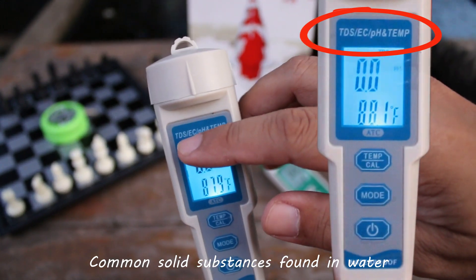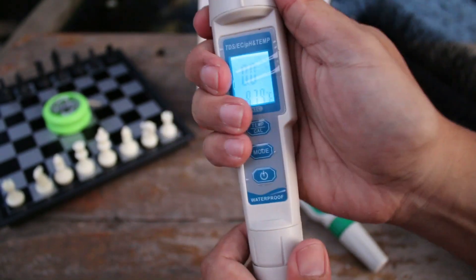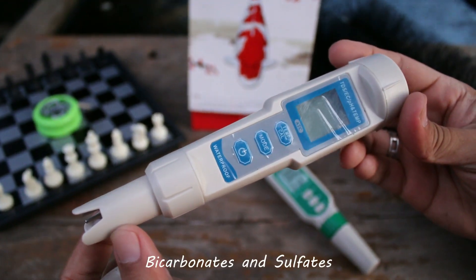Common solid substances found in water could include sodium, potassium, magnesium, calcium, nitrates, chlorides, bicarbonates, and sulfates.